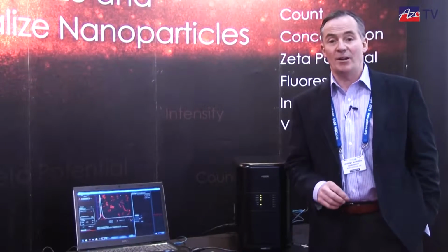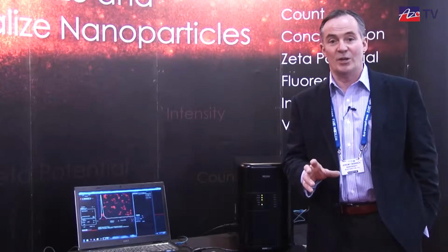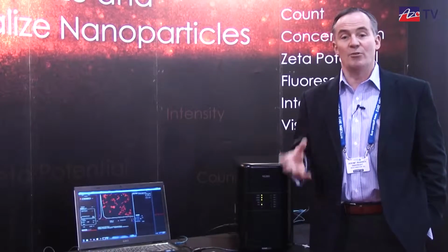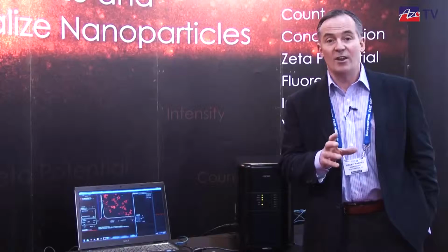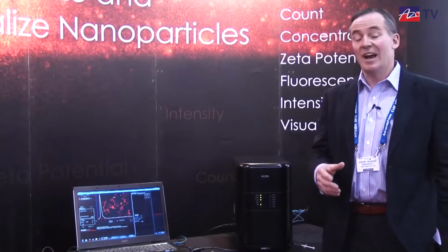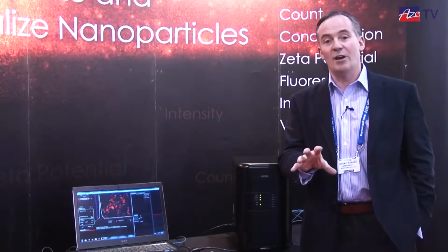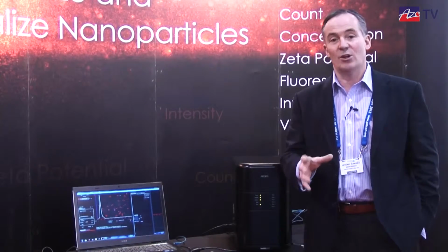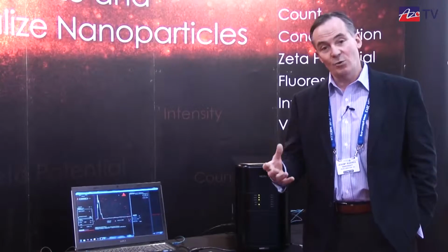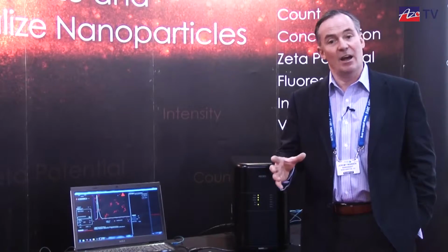If we can see the particles and measure them frame to frame, we can apply a diffusion coefficient calculation to each one, measure the sizes, and produce a particle size distribution that is truly high resolution. We also know the volume that we have here, and that allows us to produce a concentration measurement. So the interrogated volume we know, we measure the concentration. So we have a combination both of particle count and particle size distribution at a high resolution format.